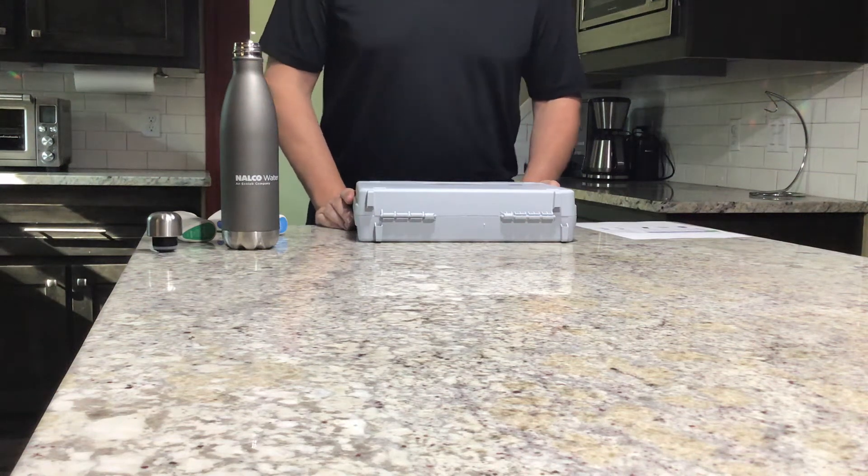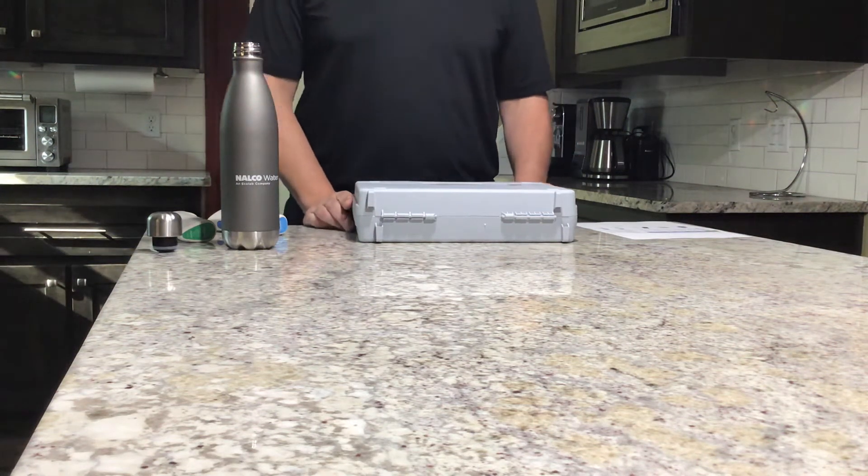Hello. Today we're going to be introducing how to use the Nalco SBC 100 Digital Chlorometer.